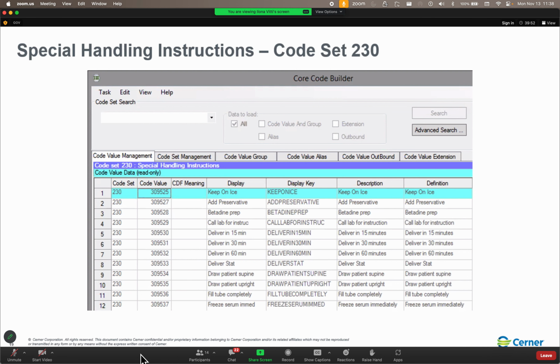And we're going to start with collection priorities. So remember in our activity this morning where we selected the timed study collection priority and the timed study reporting priority defaulted in? That's because of the build that was done in the collection priorities application.